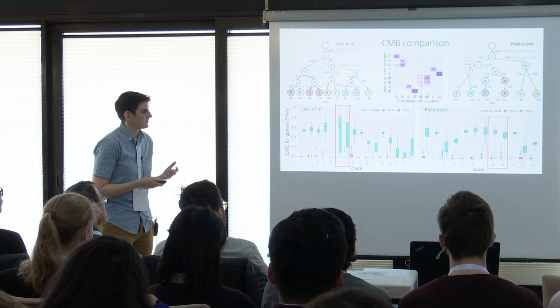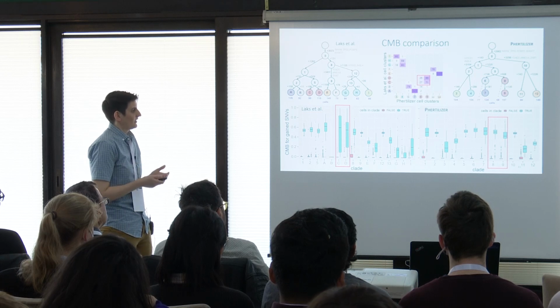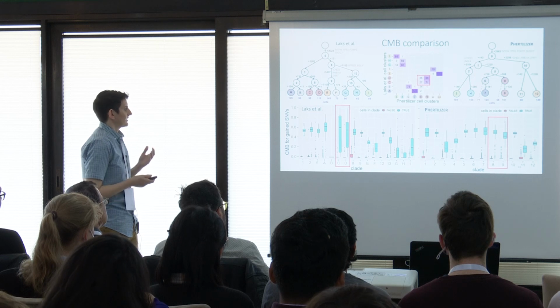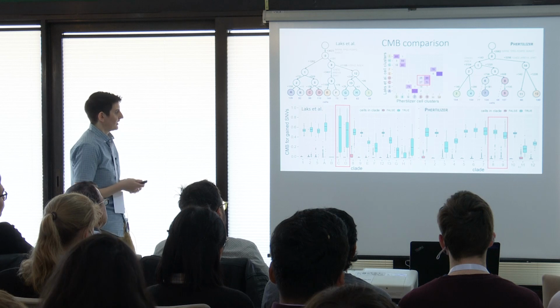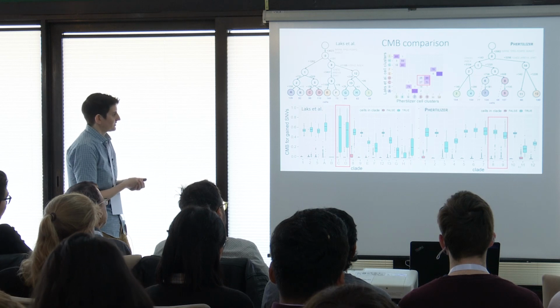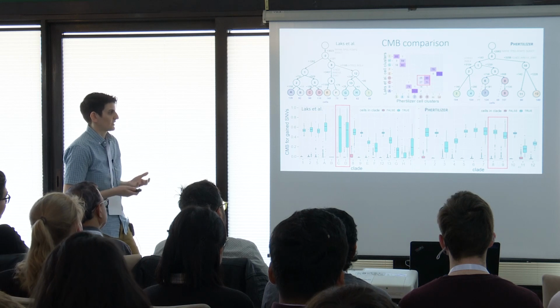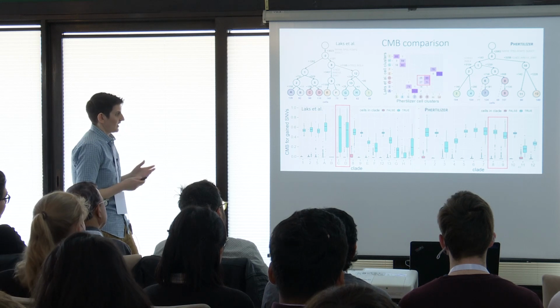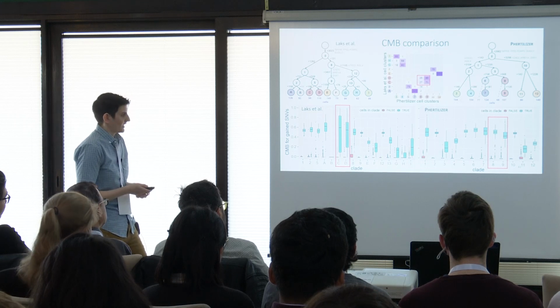So now we can use this metric to get better insight into the real data. Going back to the comparison between our clades 8 and 9 and the clusters C and D, you can see that there was very high variability for their clusters C and D, whereas Phertilizer had good separation while still maintaining a median of 0 for cells outside of the clade, suggesting perhaps a better fit for the data.